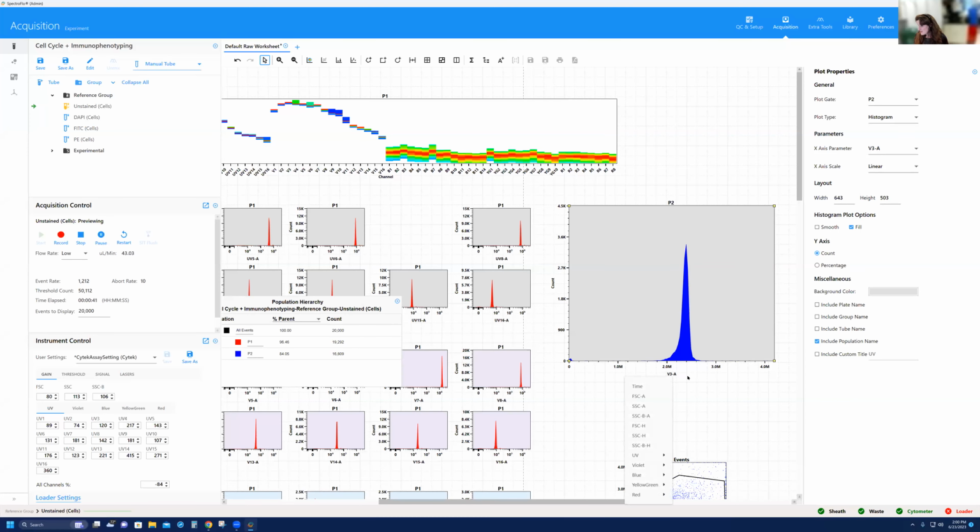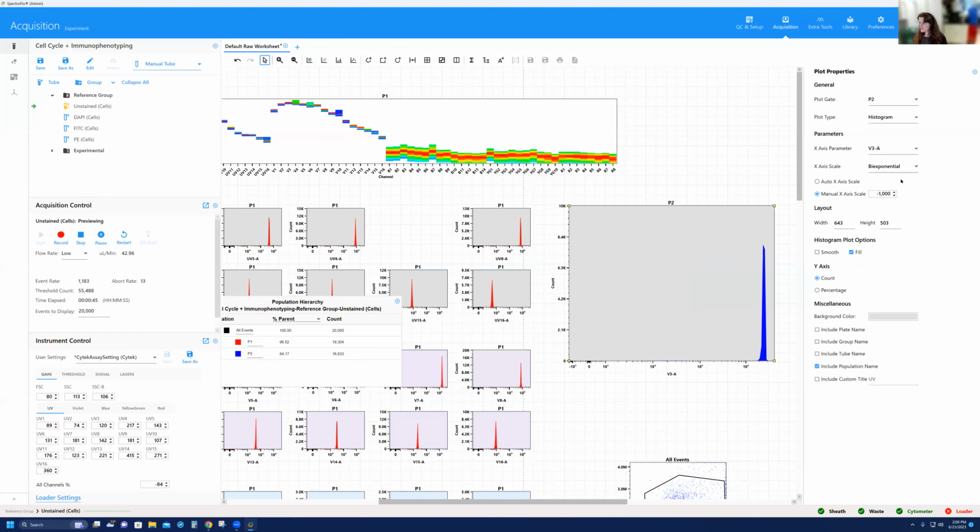Now, this is a little bit high still. So if I wanted to, I know that might seem a little bit silly based on what I just said, because it's at that higher end in the logarithmic scale, maybe I'll bring it down a hair. So I'm changing my mind. Let me bring it down by 20%, and all of those detector gains come down an equal percentage. Okay. Now, why is this important?